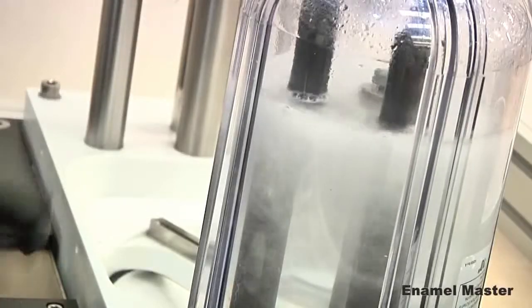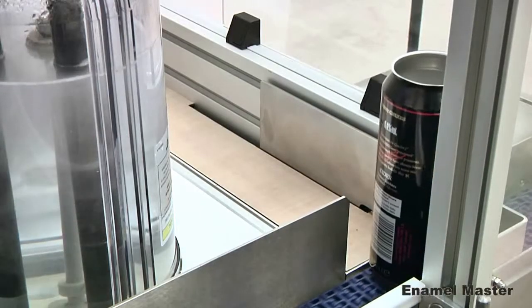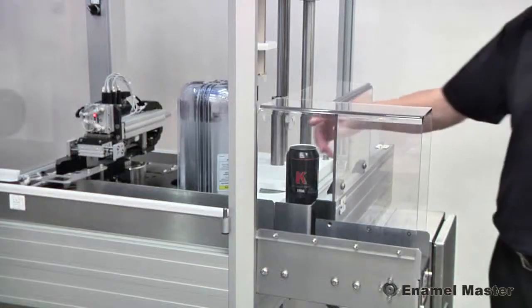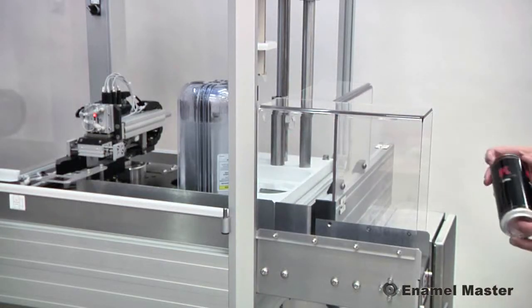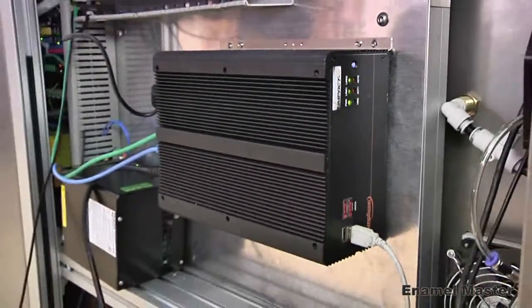Mechanical pumps have been removed from the electrolyte system and replaced with an innovative electrolyte handling system. Careful choice of construction materials ensures durability, and a simplified computer installation.